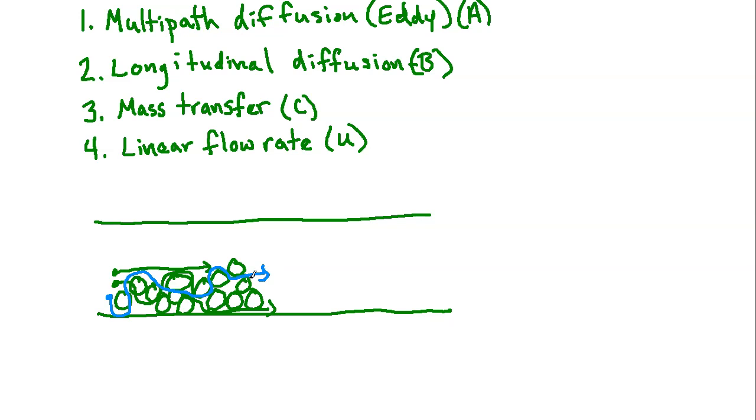It's because when we take a stationary phase and we attempt to pack the particles in there for separation, there is the potential that there could be multiple paths that these analytes can take. And if they take multiple paths, they're going to be crossing over different amounts of surface area, and that as a result means that you could have some broadening as they're all trying to make their way through, right?